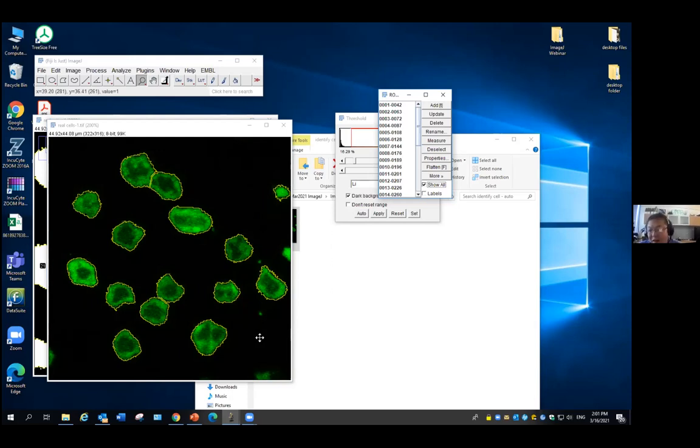So again, it's always your choice, but keep in mind that our goal is not to find the image processing that gives us the best result in a single image. If you want to do that, I would suggest you manually draw those ROIs, based on your personal preference for what is best for this image.